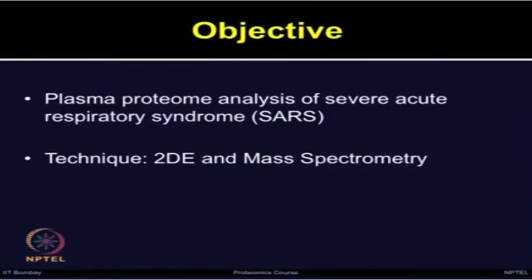In this study, the authors employed conventional two-dimensional electrophoresis, analyzed the images from the treatment with the controls, and identified the differentially expressed proteins by using mass spectrometry techniques, including MALDI-TOF and LC-MS/MS. Finally, the interesting identified proteins were validated using techniques such as Western blots.